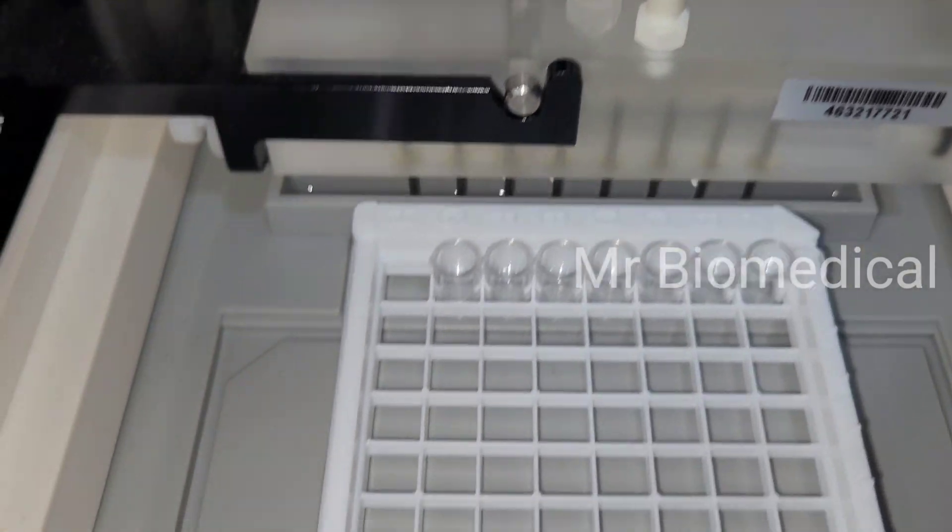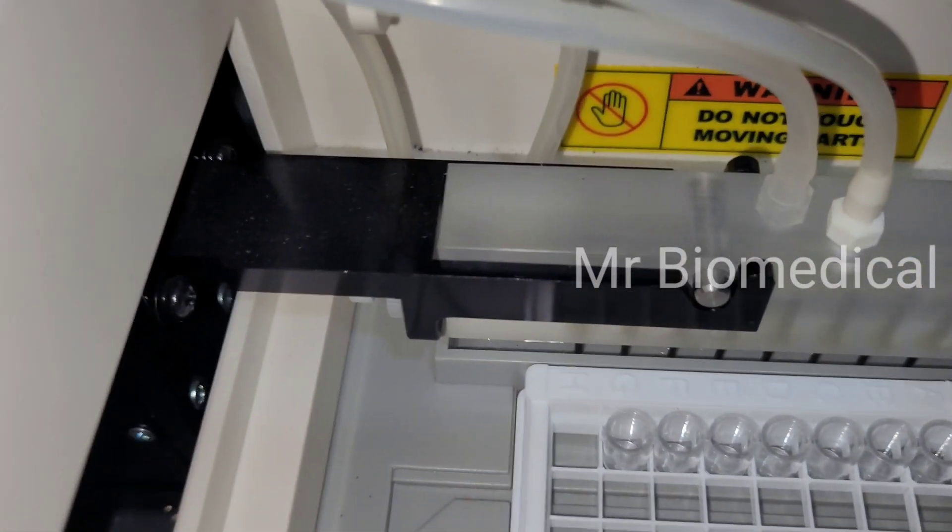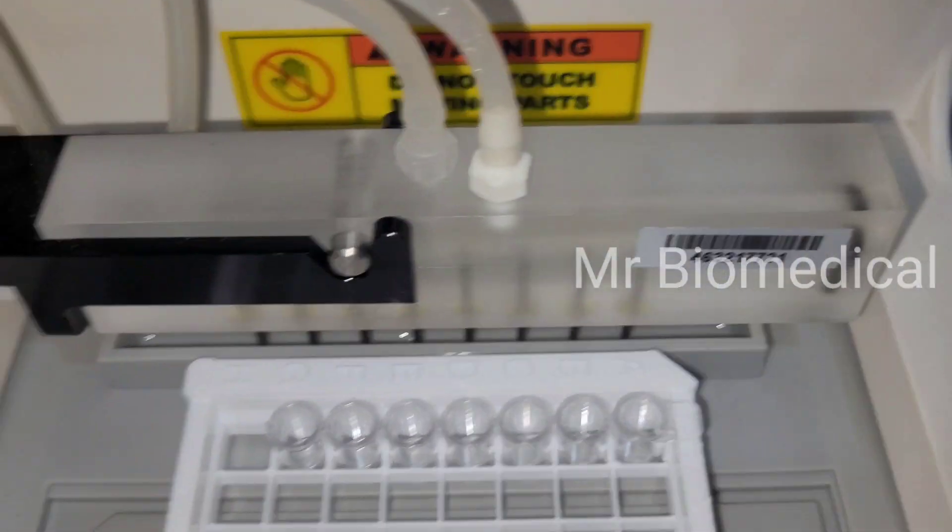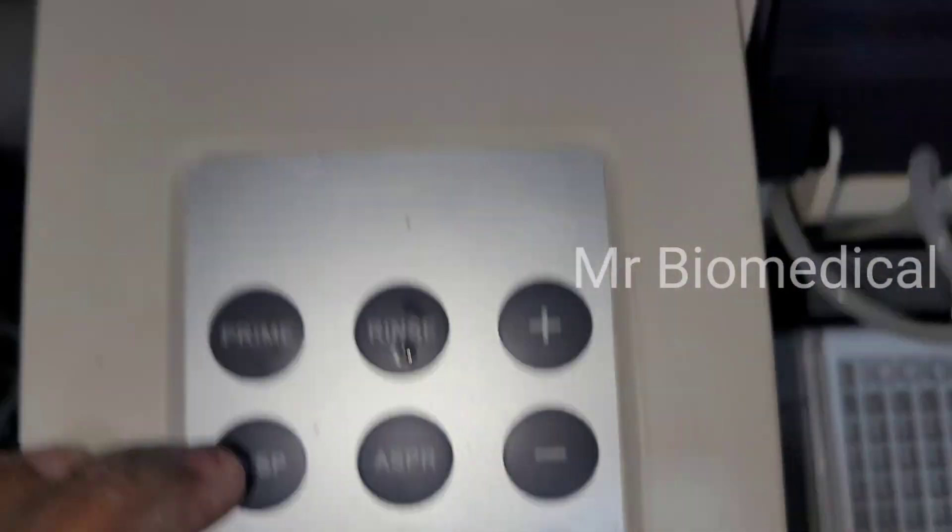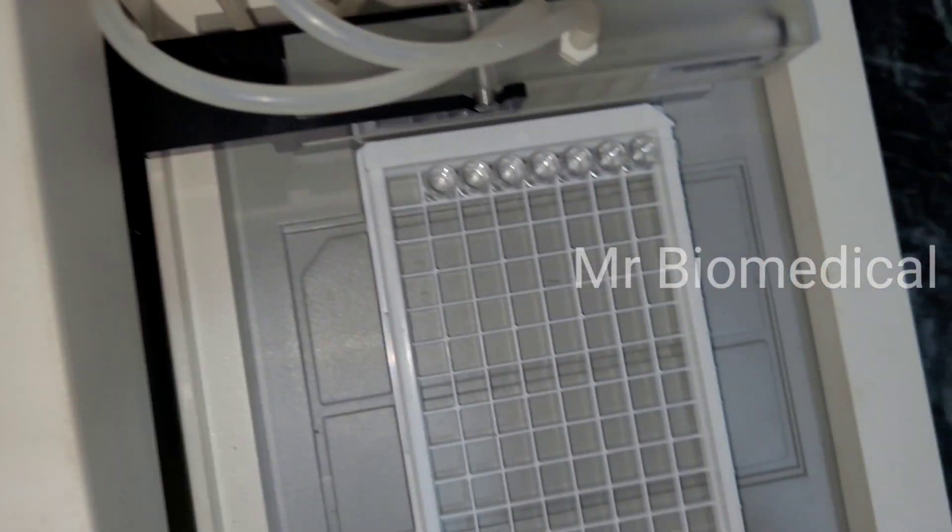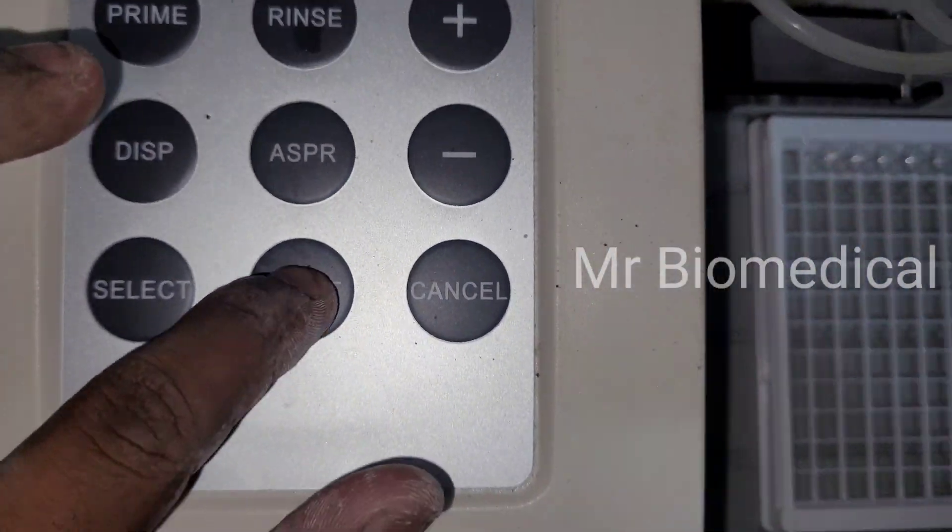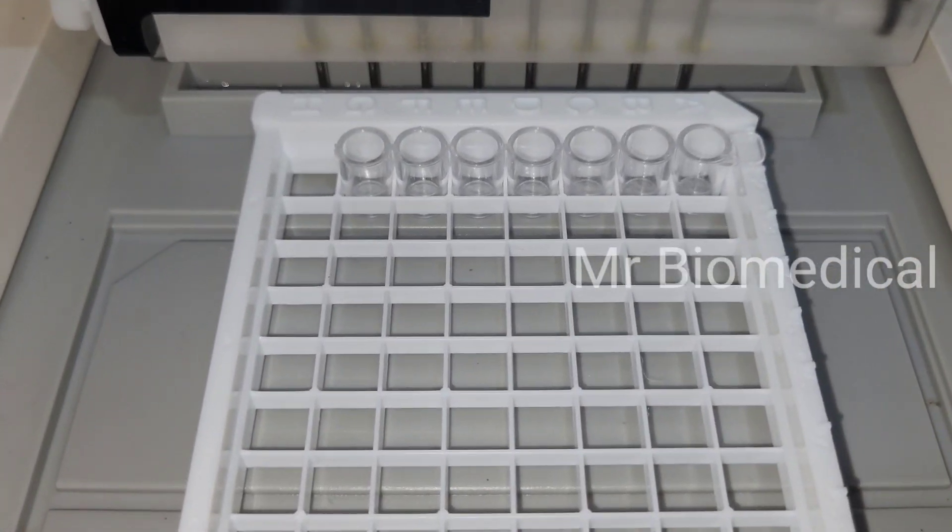Now the main thing is the seven needles have to clean these seven cuvettes. So here we have seven cuvettes, so it will go inside and clean all the cuvettes. If it doesn't, we have to clean it with a needle or something because it will get blocked inside.